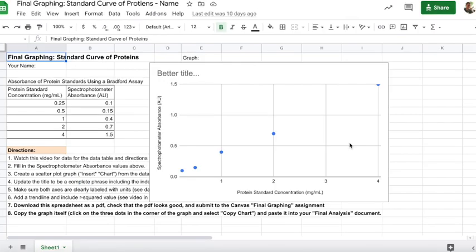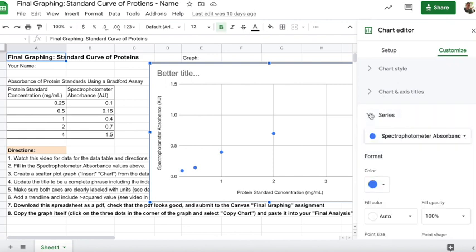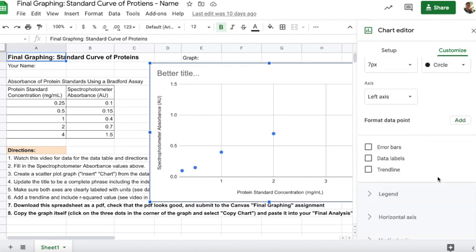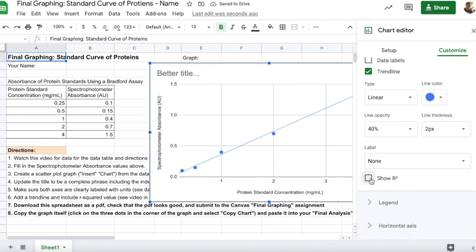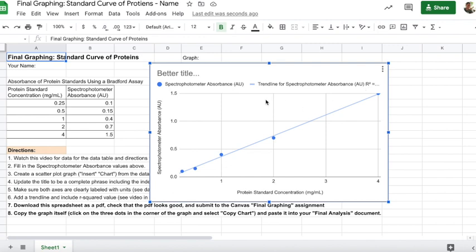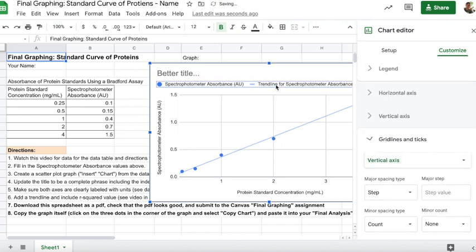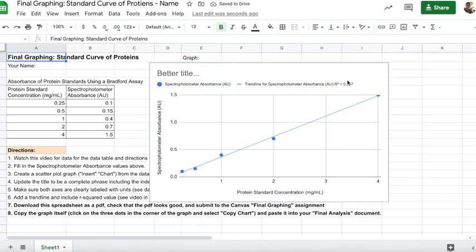Now create a trend line for the data. Double-click on the data points to open the chart editor, then go to the Customize tab, find the Series section, scroll down, and check the box that says 'Trend line.' Then scroll down and check 'Show R squared' — that tells you how accurate your line is relative to your points. If the R squared value gets cut off, resize your graph or change the font size to make sure it shows completely.